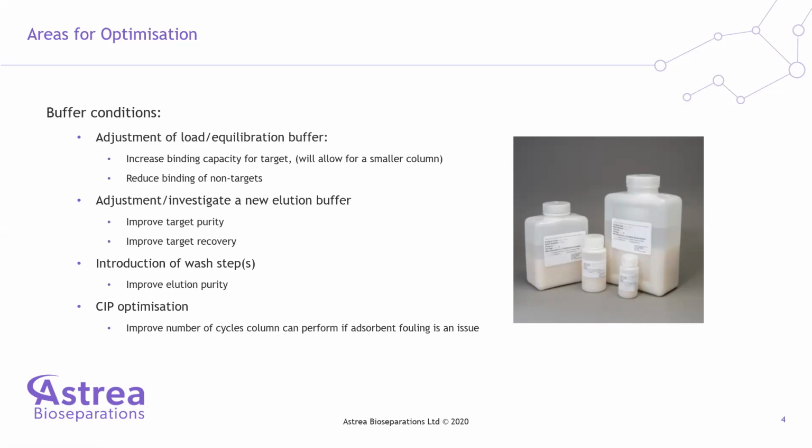Now, it's often that people don't want to optimize or adjust their feedstock. Therefore, this usually is one of the last areas that we look to optimize, and we'll look to other areas before we start altering our feedstock.